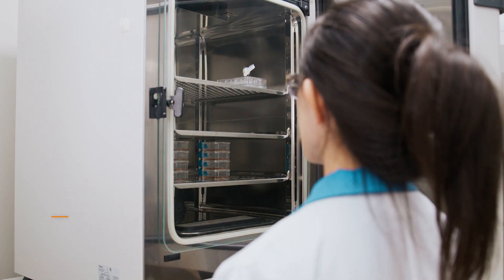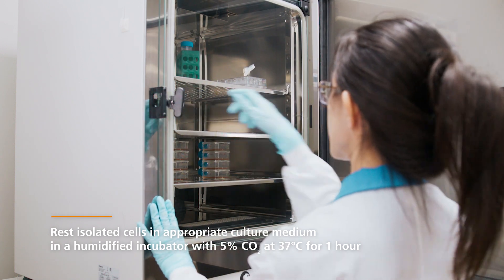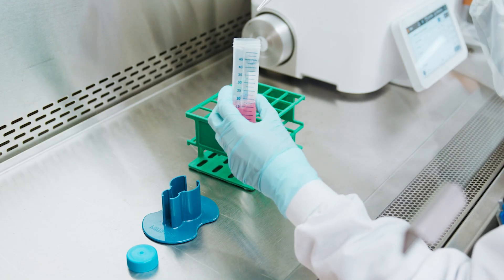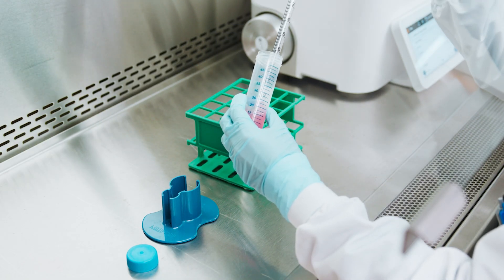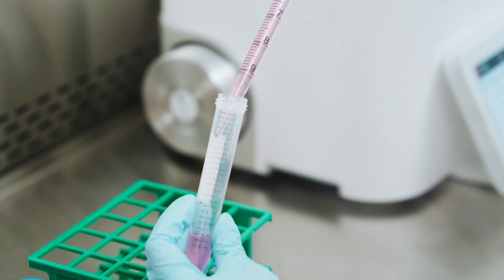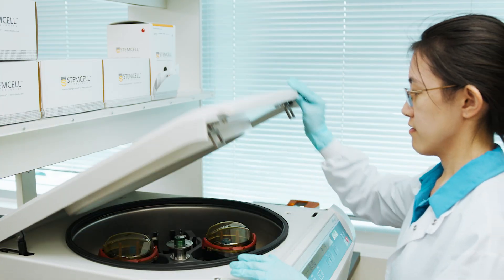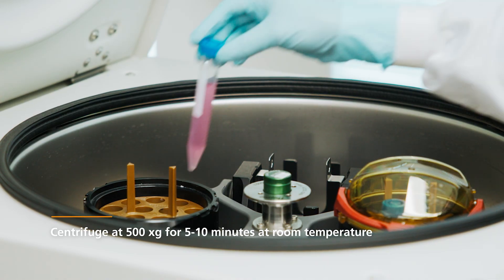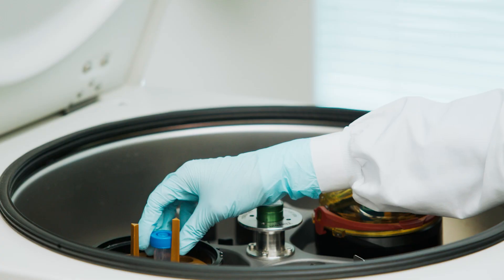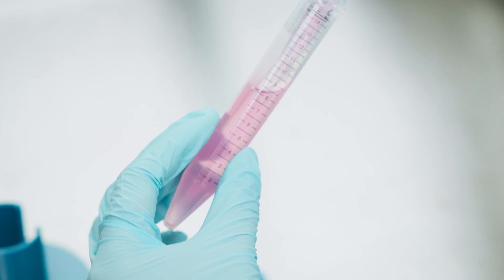When working with fresh or cryopreserved cells, it is recommended to rest the cells in an appropriate culture medium for a minimum of one hour in the incubator. After resting, perform a cell count. Transfer 14 million T-cells into a new tube. This quantity represents the exact number required for 5 reactions plus 2 controls. Spin down the cells in a centrifuge. Carefully remove the supernatant, taking care not to disturb or aspirate the cell pellet.